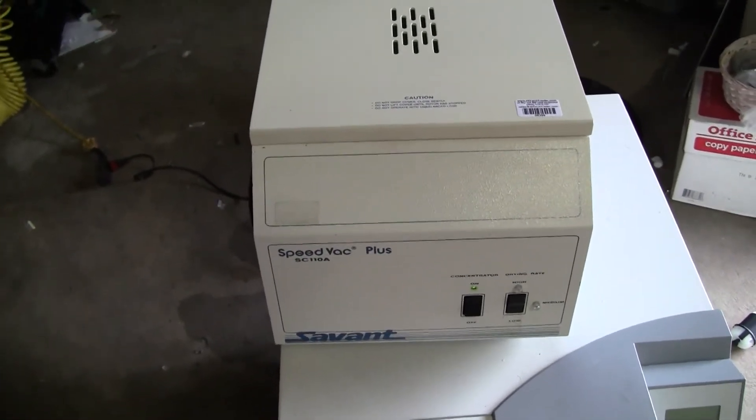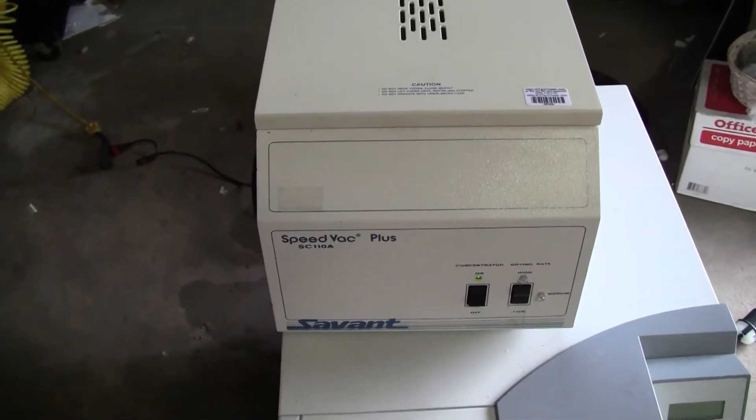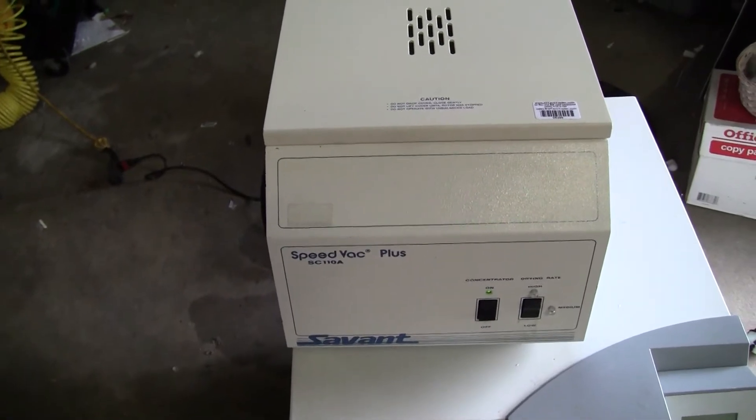Good afternoon from Hitek Trader. This is the Savant SpeedVac Plus SC110A.